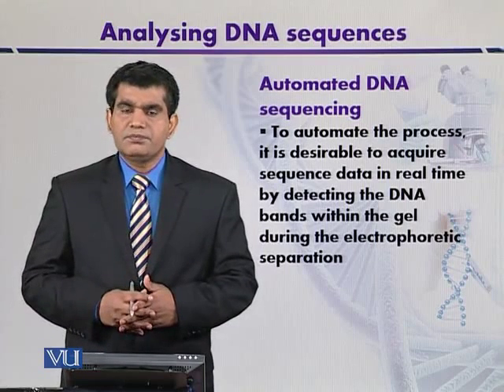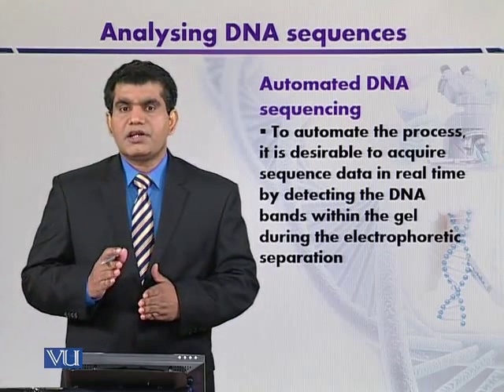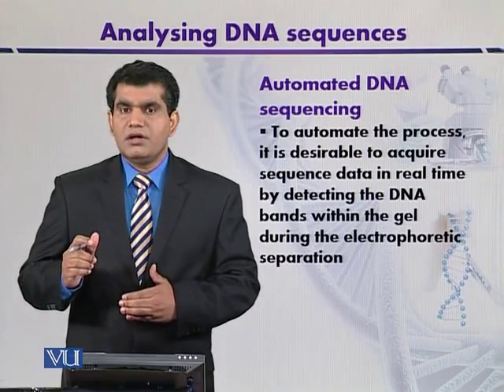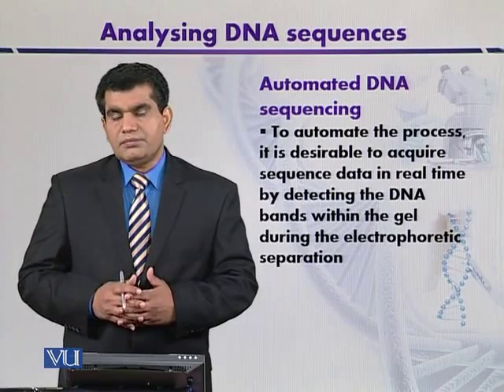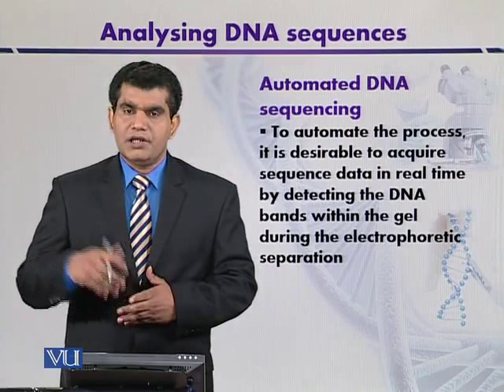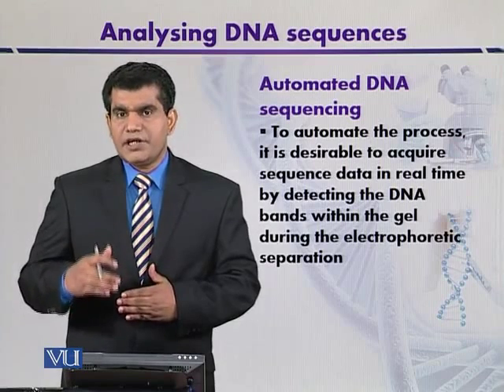And suppose here in case of the Sanger method, the reactions are carried out separately in 4 different reaction mixtures, and after performing the reaction, the different fragments that are variable in length are detected by using a specific detector.